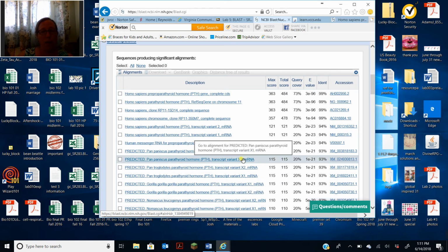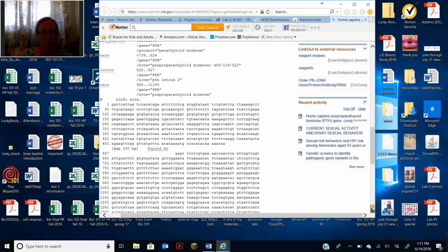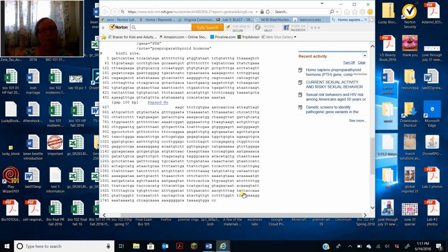And it's kind of doing a comparison. That's really what it is. You're looking at these letters, right? And you're saying, well, how many of those letters match something in here? Okay, and when you're doing these types of things in the lab, you sometimes will get back your sequence data, like that electropherogram.